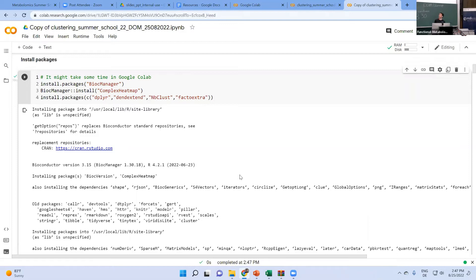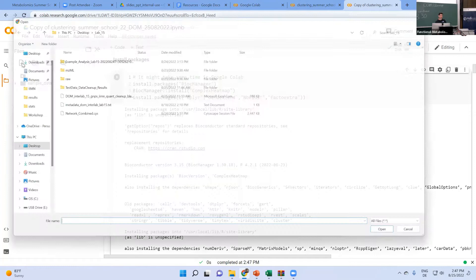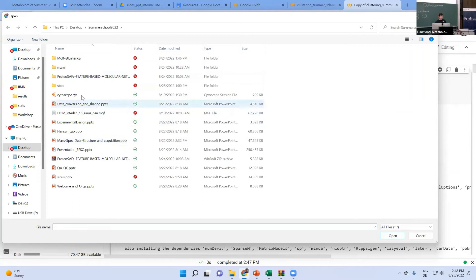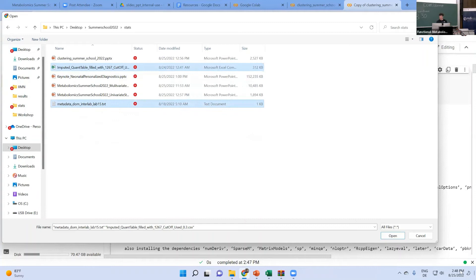Now we will upload our files. We need the same files as before for the entire session — the feature table (the imputed quantification table) and the metadata. This is the same input as for PCoA.